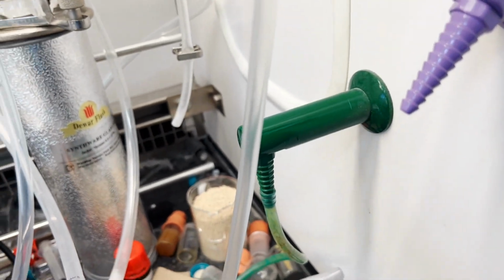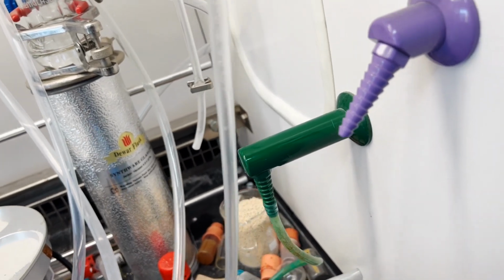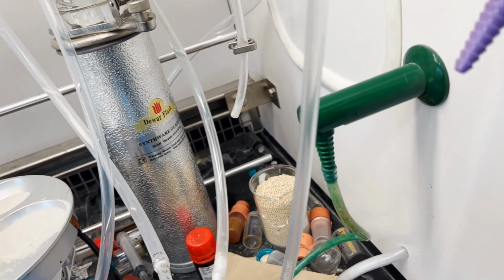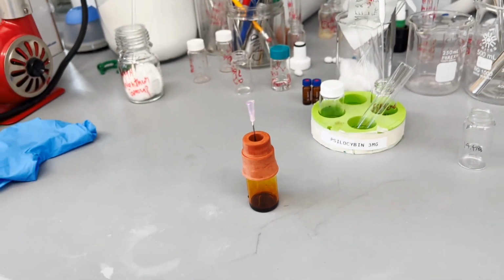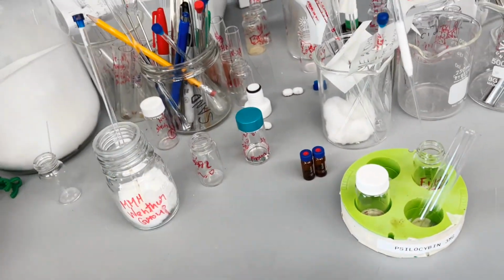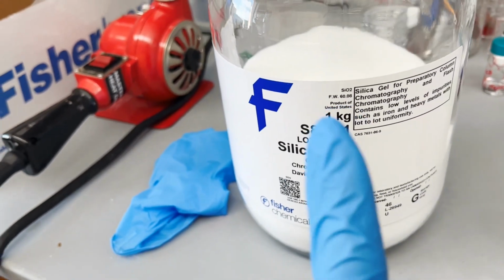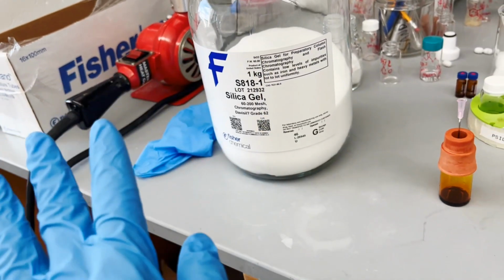Also, if you want to take the proton NMR or carbon NMR of this crude material or the purified material, definitely for the Schiff base, you should neutralize your CDCl3 to do the NMR. If you don't know how to neutralize CDCl3, please watch my previous video on this. I uploaded one video on how to make neutralized CDCl3.